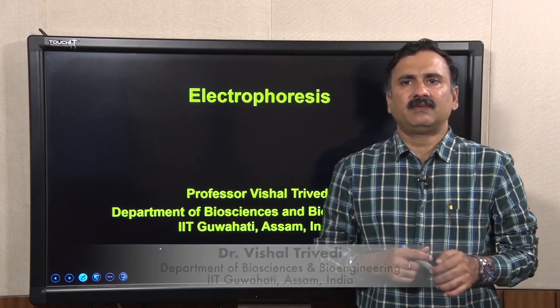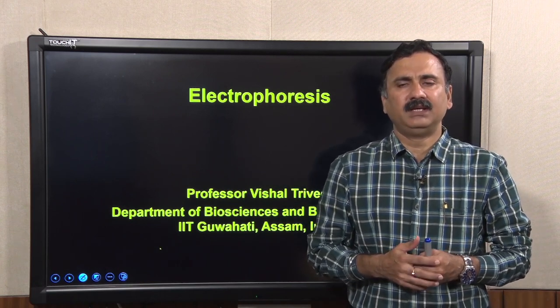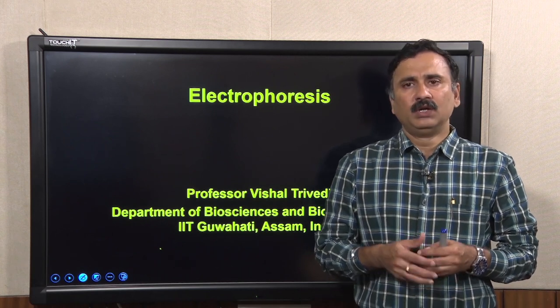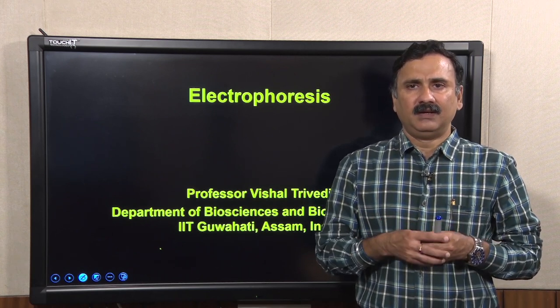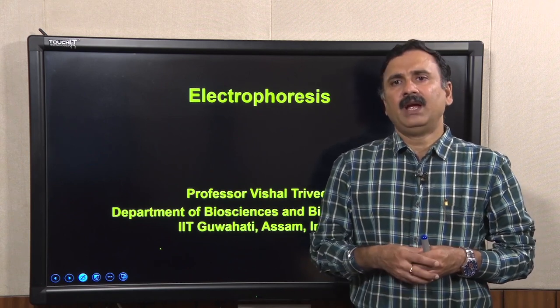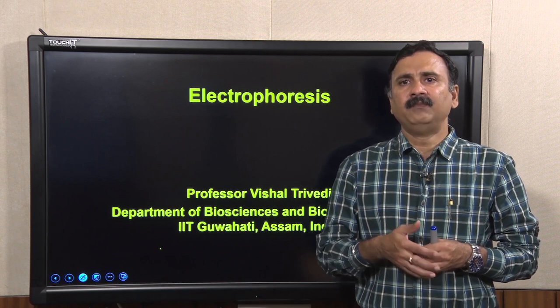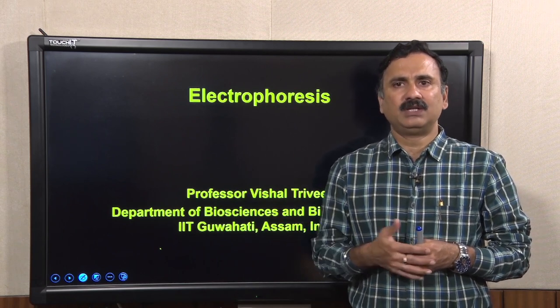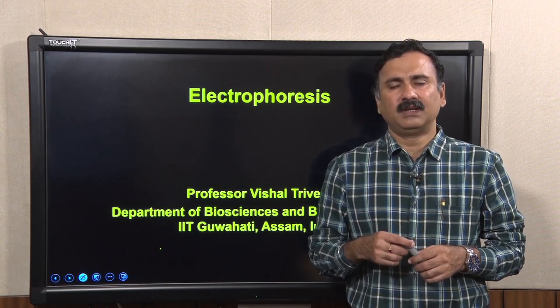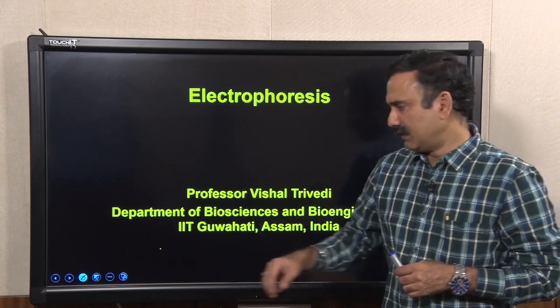And let's start our new topic, and the new topic is electrophoresis. Electrophoresis is a technique used to analyze biomolecules such as proteins or DNA, and to separate them based on charge, molecular weight, or other biochemical properties. So let's start discussing electrophoresis.